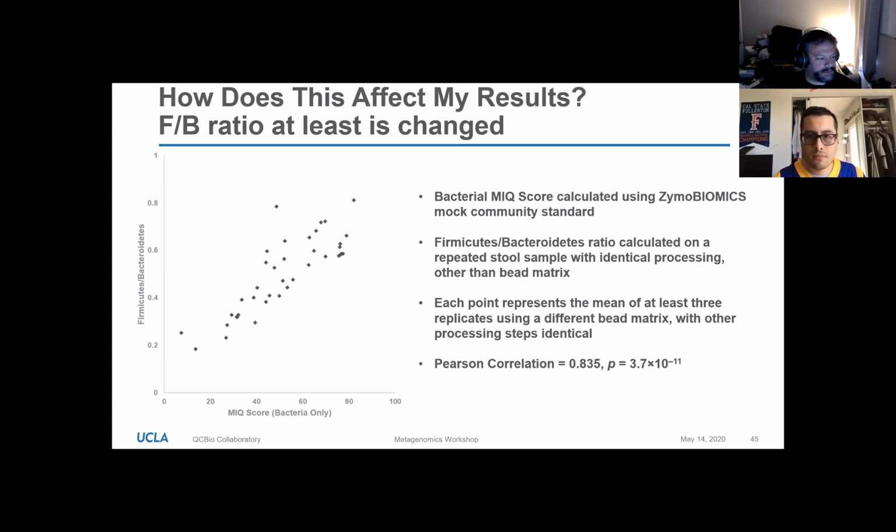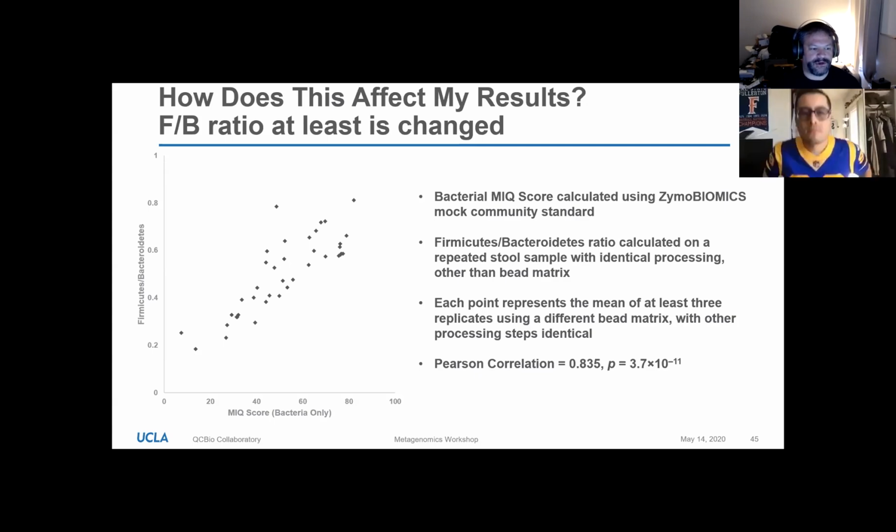One thing to consider with experiments, and this is just in general, although there are some specific kits that I think may be going off the market soon, is to try to ascertain if the system you're going to be using is going to remain available for the foreseeable future.